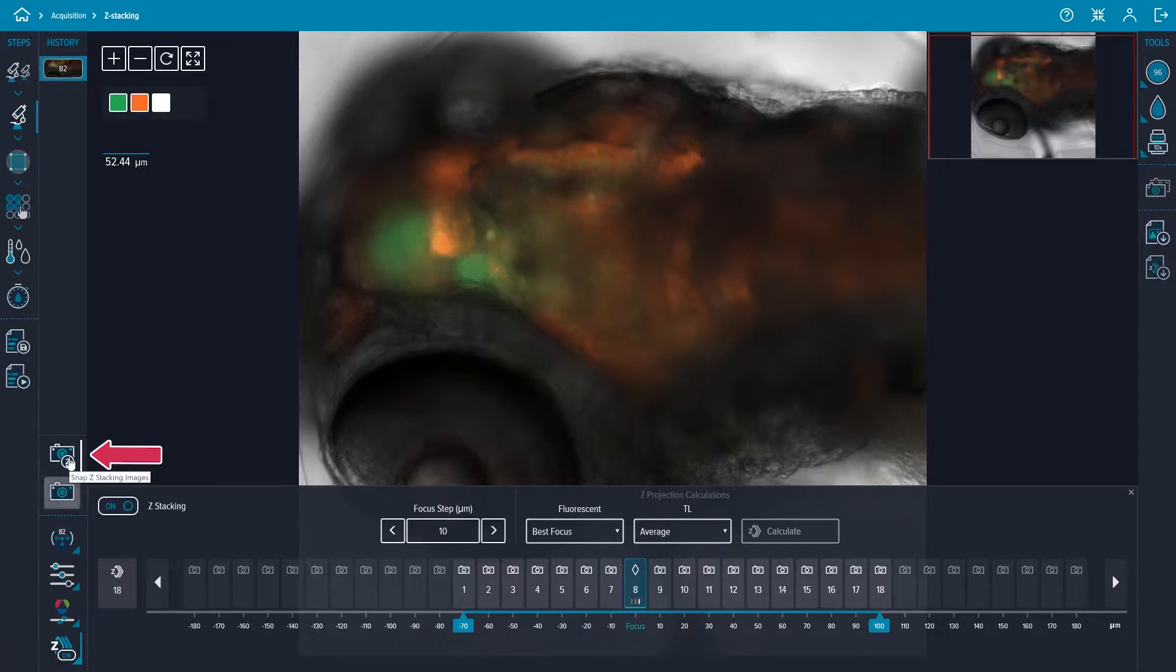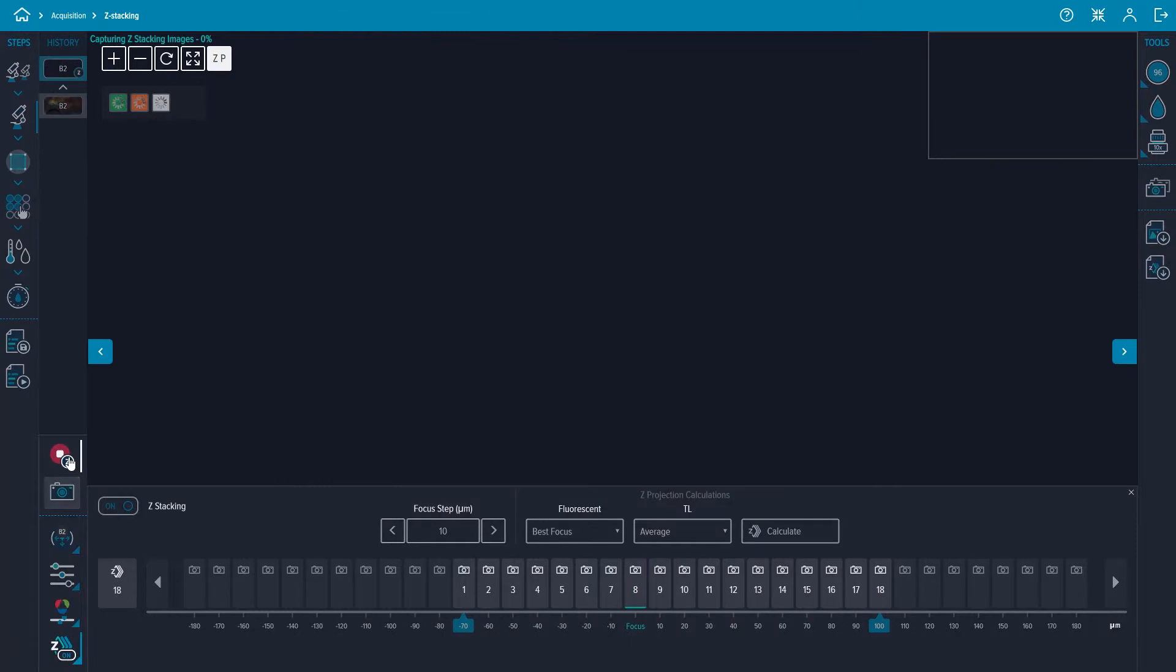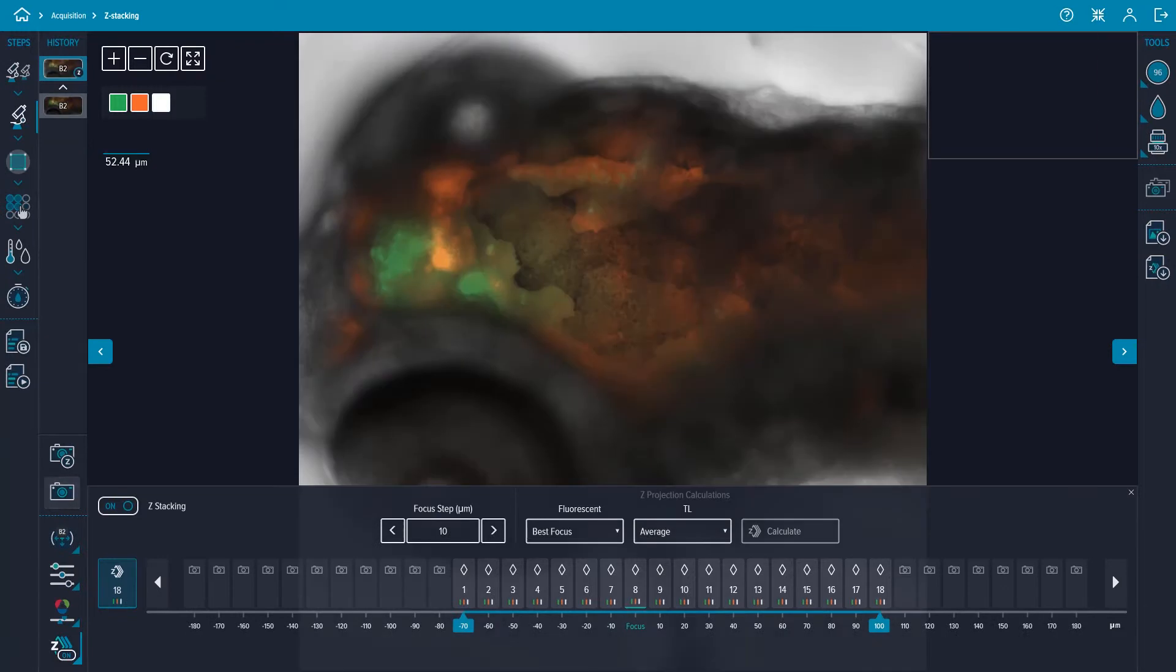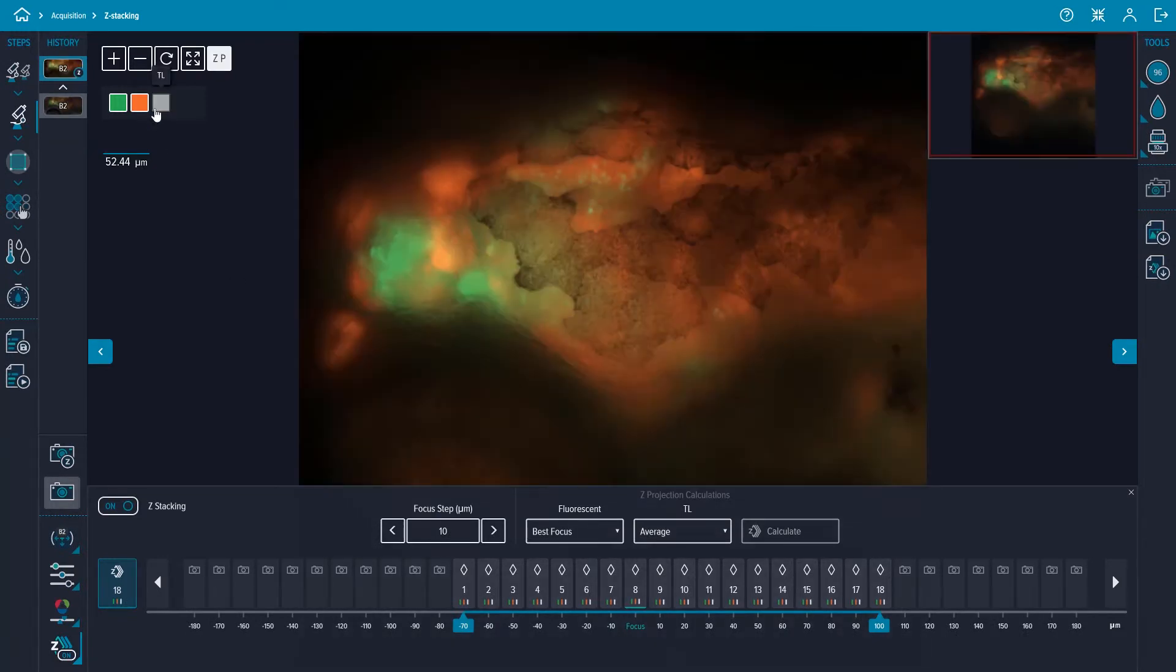Once finished snapping, the z-stack projection image will appear and the z-stack projection button to the left of the z-stack preview bar will be highlighted blue. Once again you can turn on and off the image viewer control boxes to view each channel image more clearly.